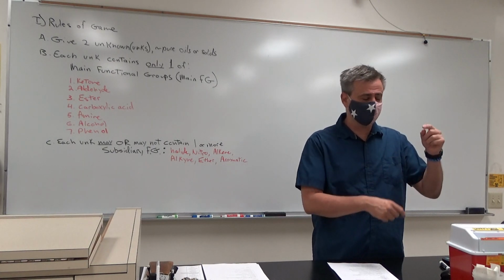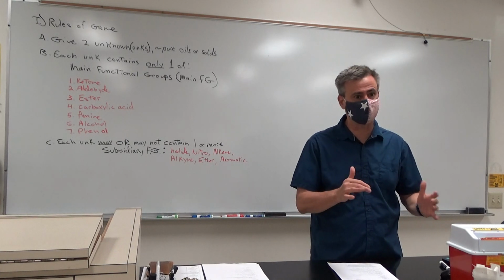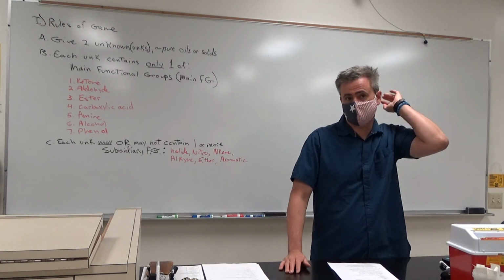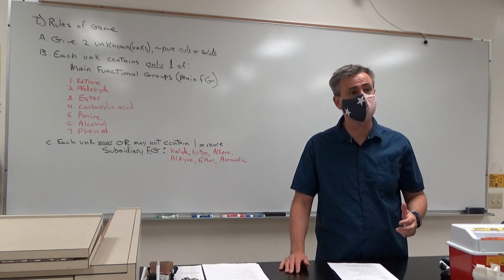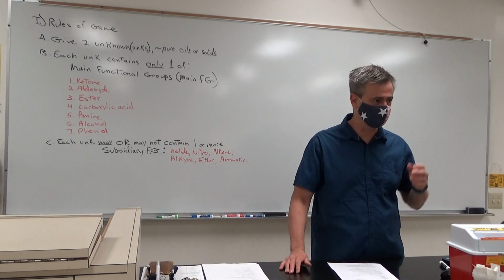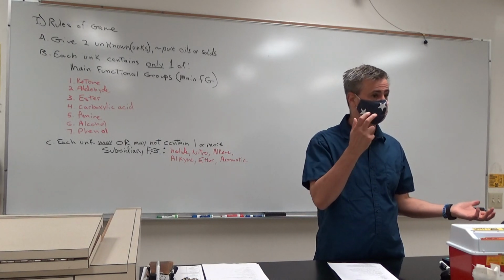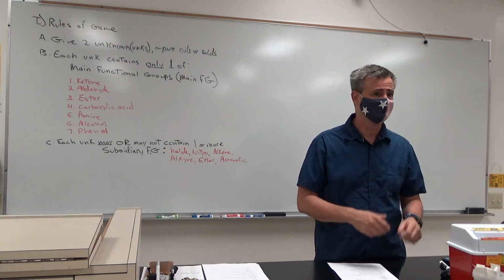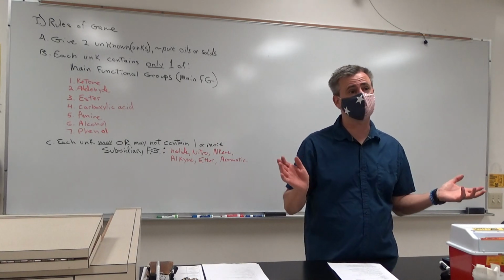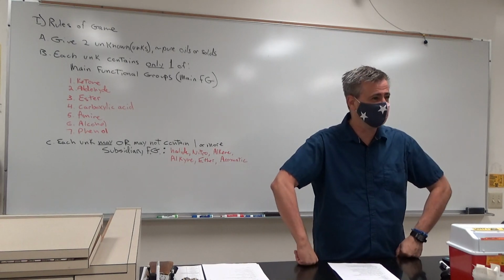Students often get a little bit worried, thinking I better do every test on every unknown, and that actually can distract you more than it helps you. Sometimes if it's a really inappropriate test for your particular functional group, it can give confusing results. You might get a precipitate, but for the wrong reason. It might be an acid-base precipitate or something like that. Does that make sense?